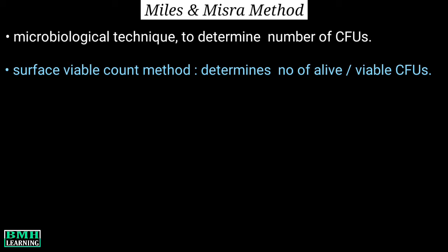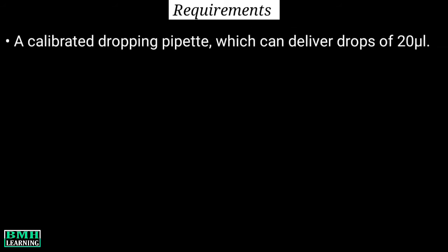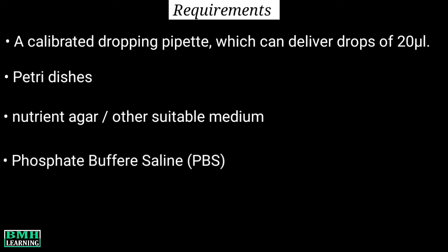The method is named so because it was first described by Miles, Misra and Irwin in 1938. Materials required: a calibrated dropping pipette which can deliver drops of 20 microliters, petri dishes, nutrient agar or other suitable medium, phosphate buffer saline or any other appropriate diluent, and most important, a good bacterial suspension.